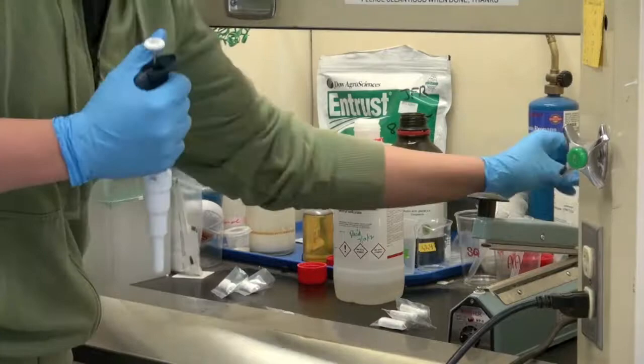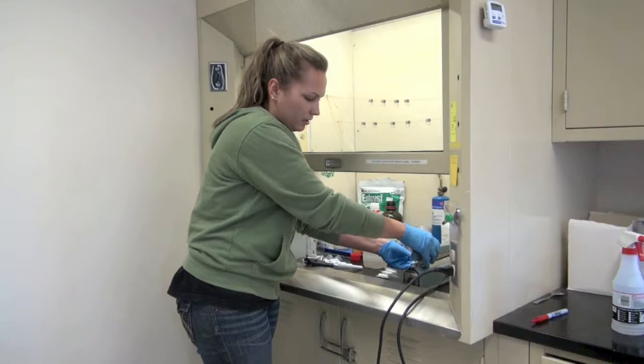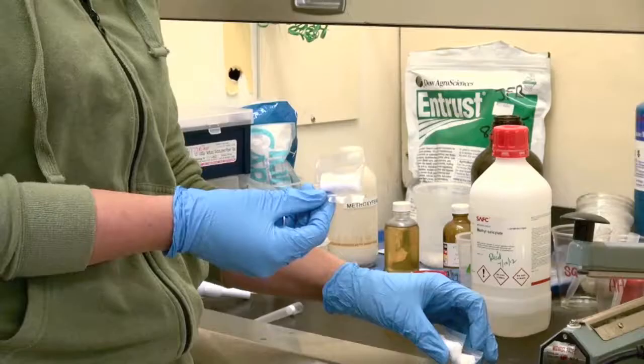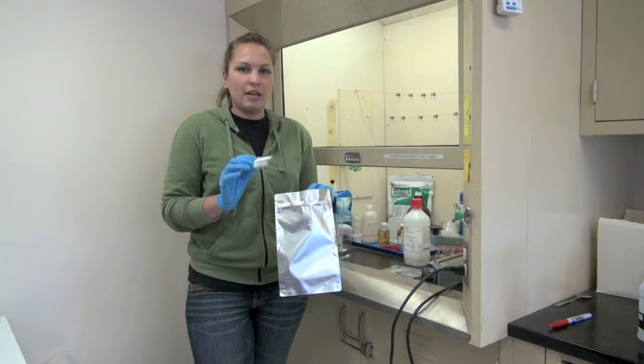From there we will use a heat sealer to seal the open end of the bag, and then that is your lure. Each lure only has one individual chemical on it, so in order to combine chemicals we will take individual lures and staple them together. Once all the lures are made, we store them in the freezer inside resealable foil bags. This helps to keep the chemical from releasing from the lure.